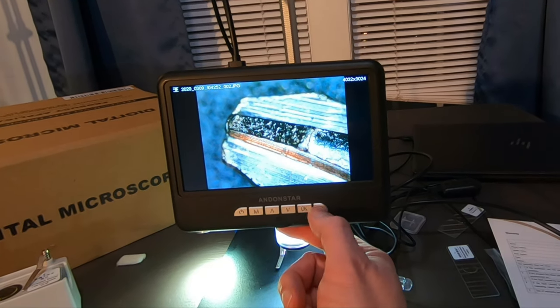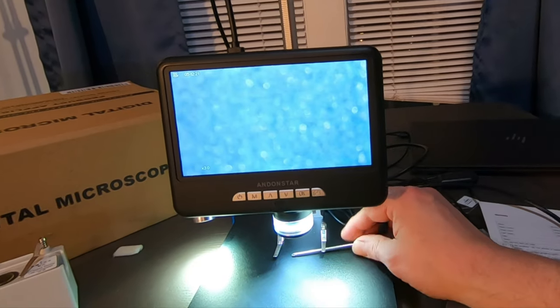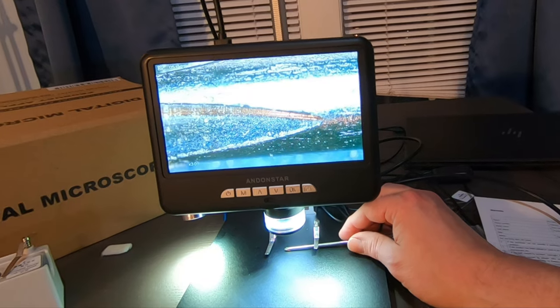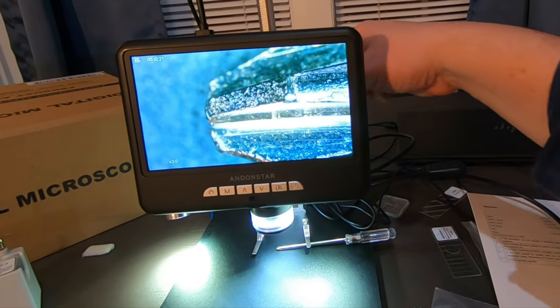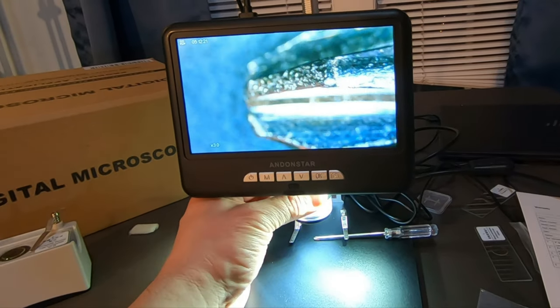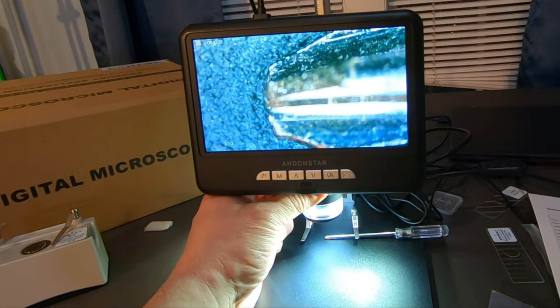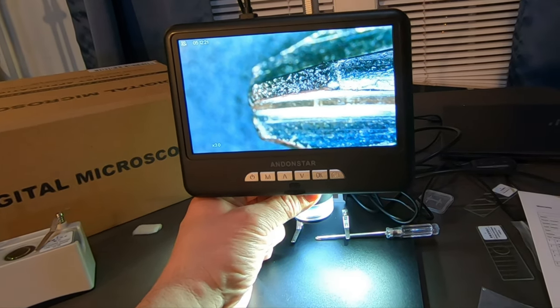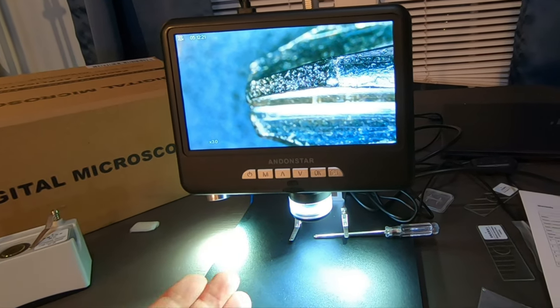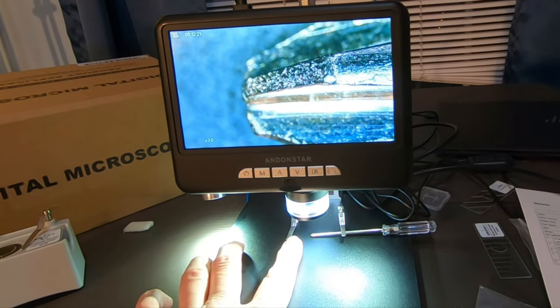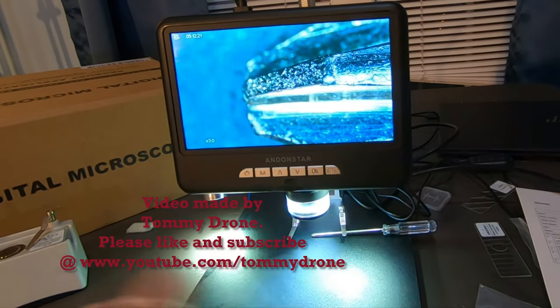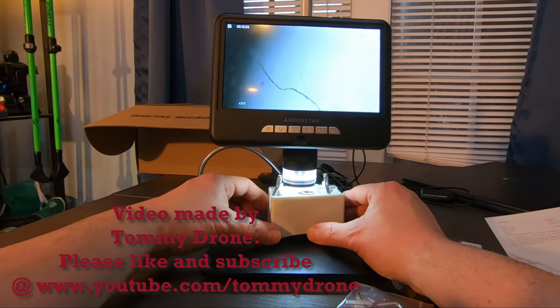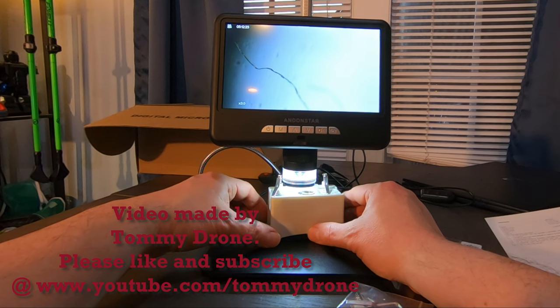And there we are. Back to our thing. Keep it still by locking it into place. Right there. And then you can really take a look at everything. And I can easily adjust the sharpness. That is just so cool. The detail you can see. So there's something really tiny. Maybe you've got a piece of metal stuck into your finger. So you can now see where that metal piece is on your skin. Kind of cool. No more curiosity. You can now take a look at anything. This is going to be great for teaching your children the importance of cleanliness. Maybe take some sheets and show them the little dust mites that are in their bed pillows.